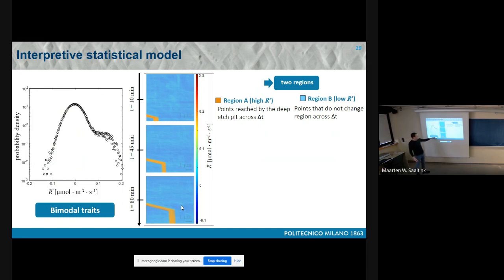Note that in some cases, when you analyze the variables in these regions, the increments are really not Gaussian. They are heavy-tailed. They have tails which vary with the distance, with the lag at which you take the increments, and then we developed a different model for that one. Let me go with a simple one.